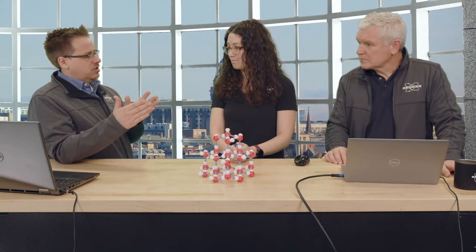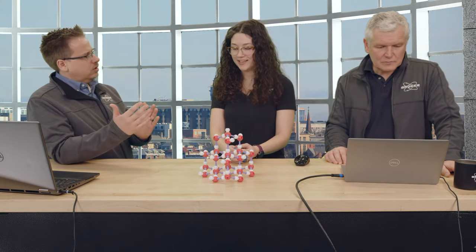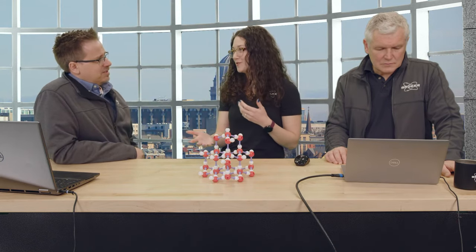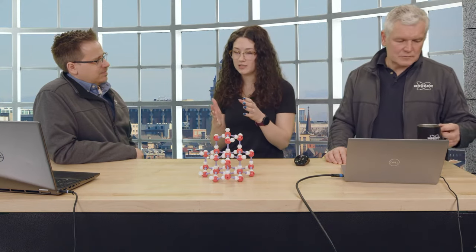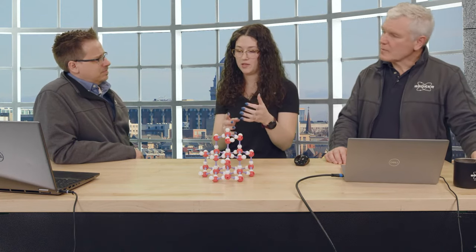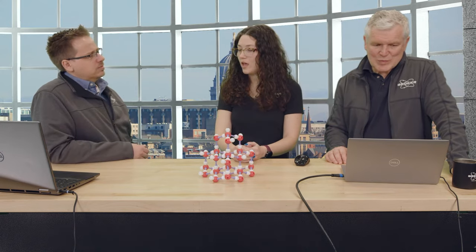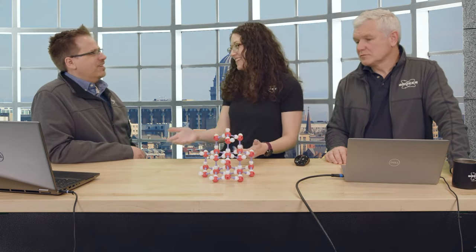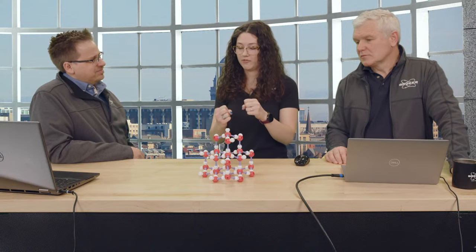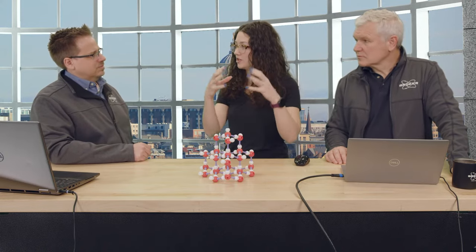Now, in terms of positioning that detector closer or farther away, what's more important here? Is it getting the most intensity by putting it close, or is it better to move it back and get better resolution to resolve the satellite peaks? It's a delicate dance between the two. Finding the right spot to separate those two reflections from each other is most important, and that will depend on your material, your unit cell, and also your source, whether you're using molybdenum or copper or silver. Which would you recommend? That would depend on the materials you're working with. But if the satellite reflections are very close to the main reflection, you may need to go to copper just to spread out your diffraction pattern a little bit.